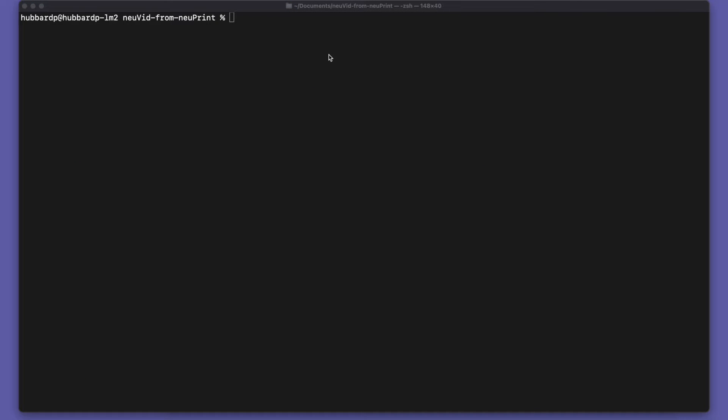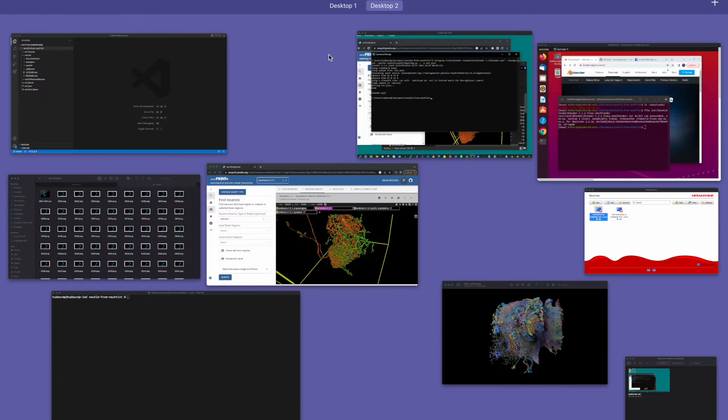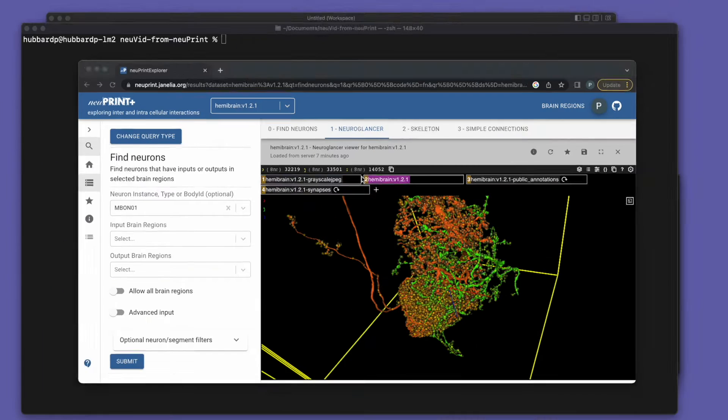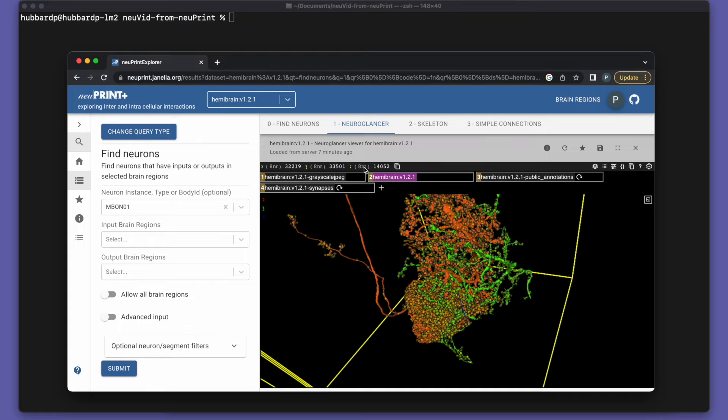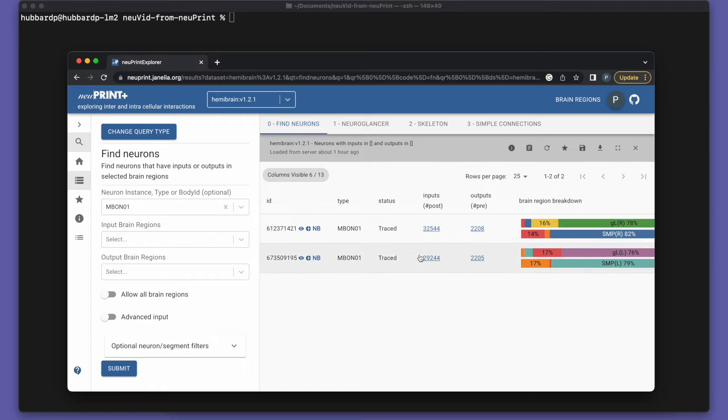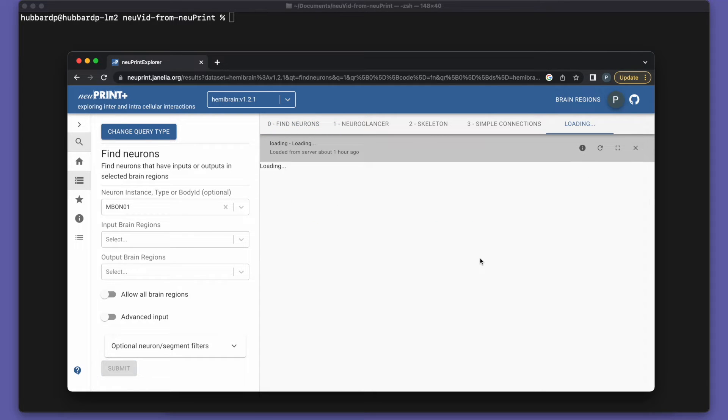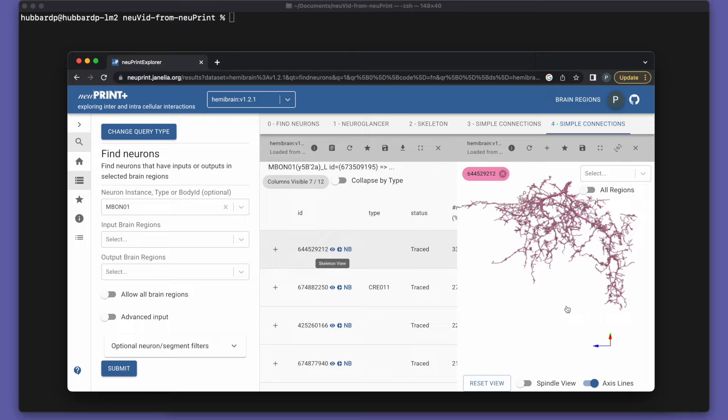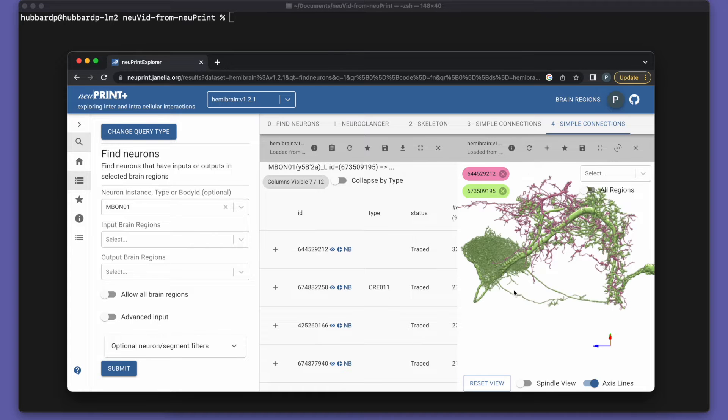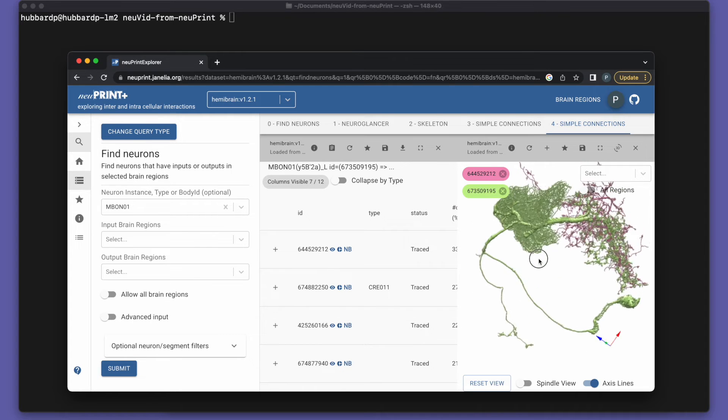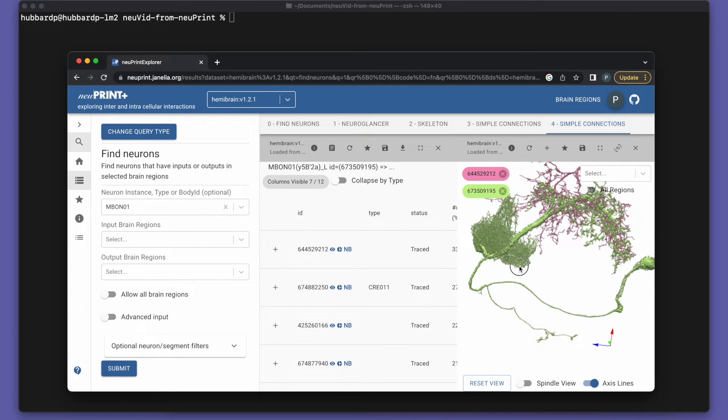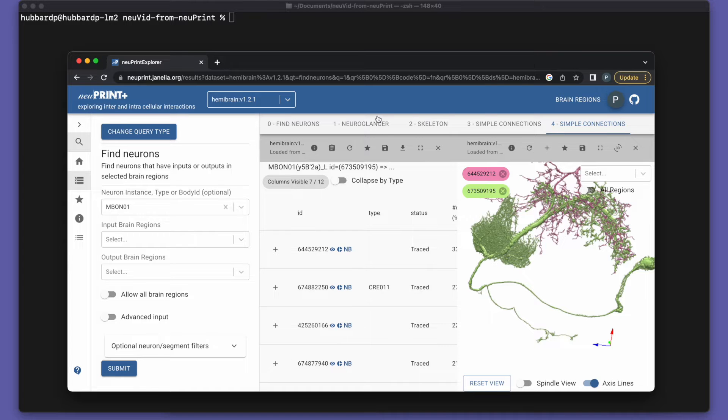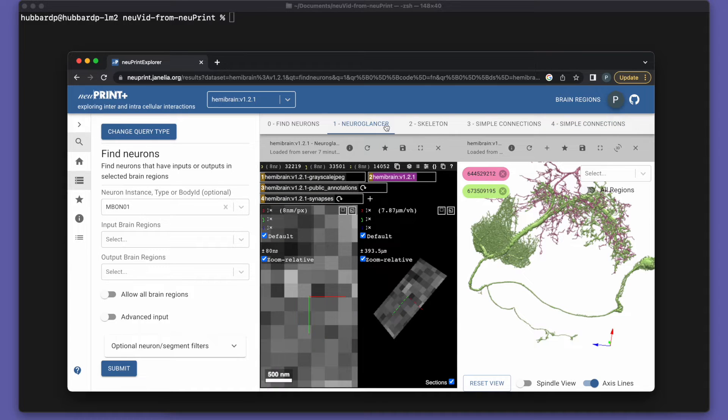Now we're ready to try something fancier. So we'll go back to Newprint. And the real power of Newprint is that it shows us the connections between neurons. So let's look at what our mushroom body output neuron outputs to. We can pick this neuron here. Looks interesting.